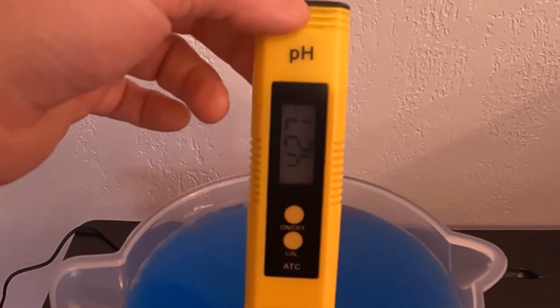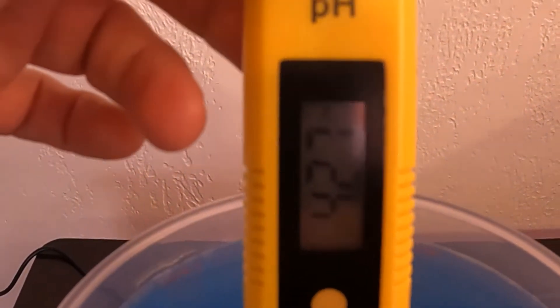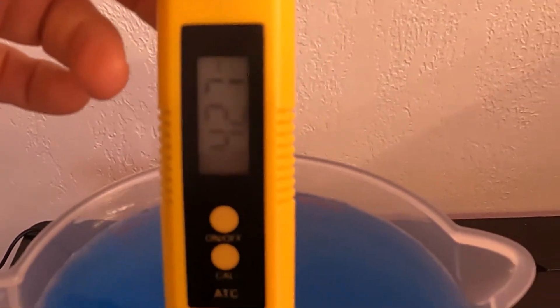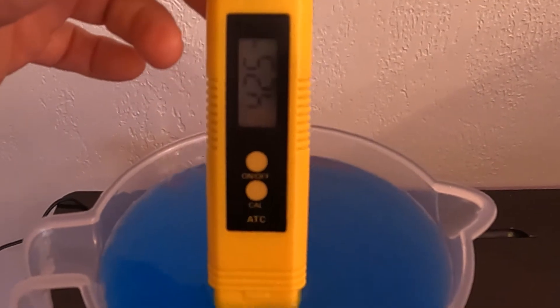Now that everything's dissolved we're going to go ahead and measure our pH. We want it to be around 5.8 and as you can see we're a little bit low. That's usually the case with the media. So we'll go ahead and grab our pH up.